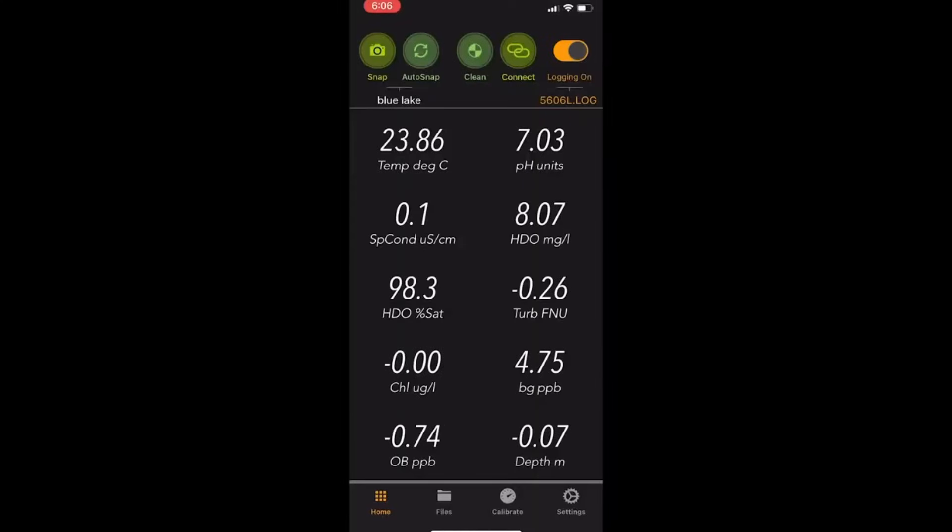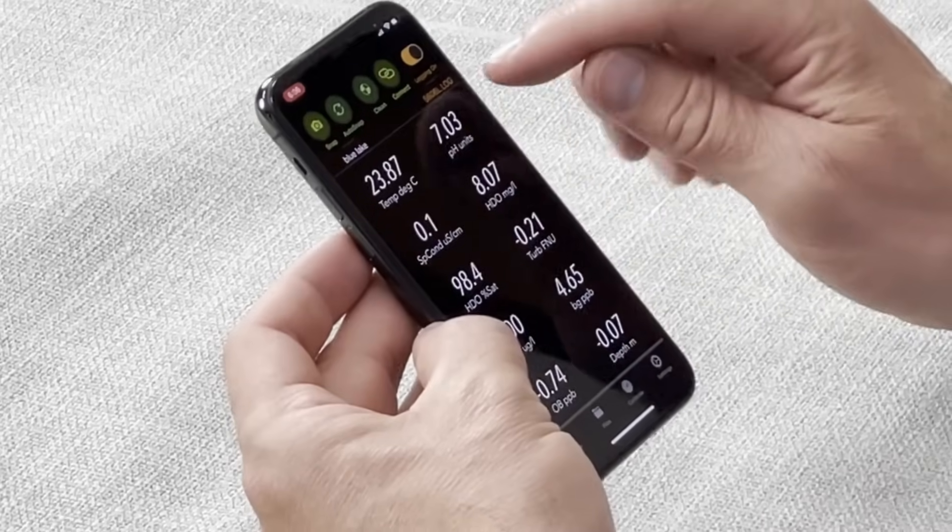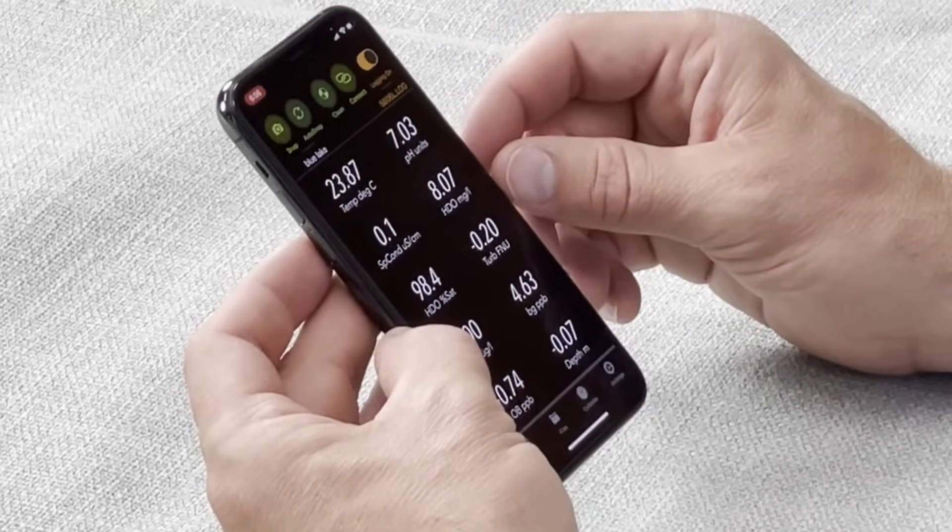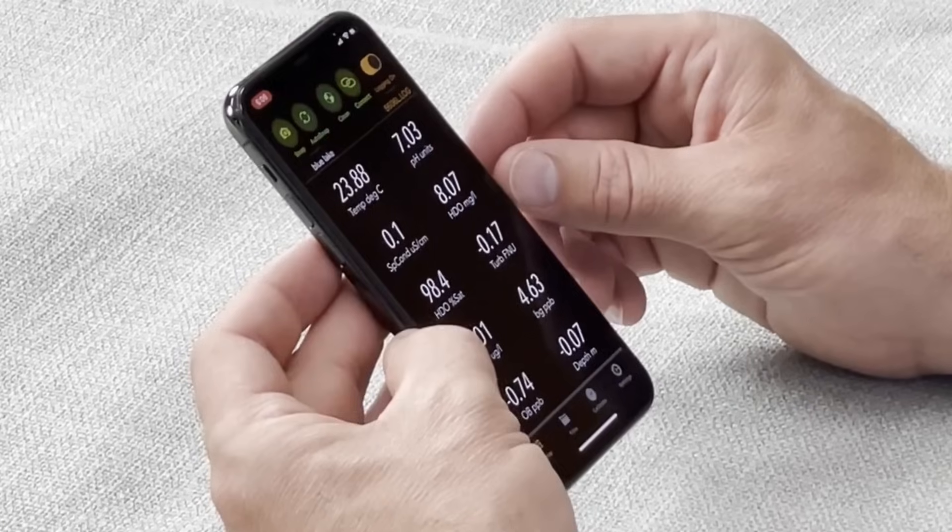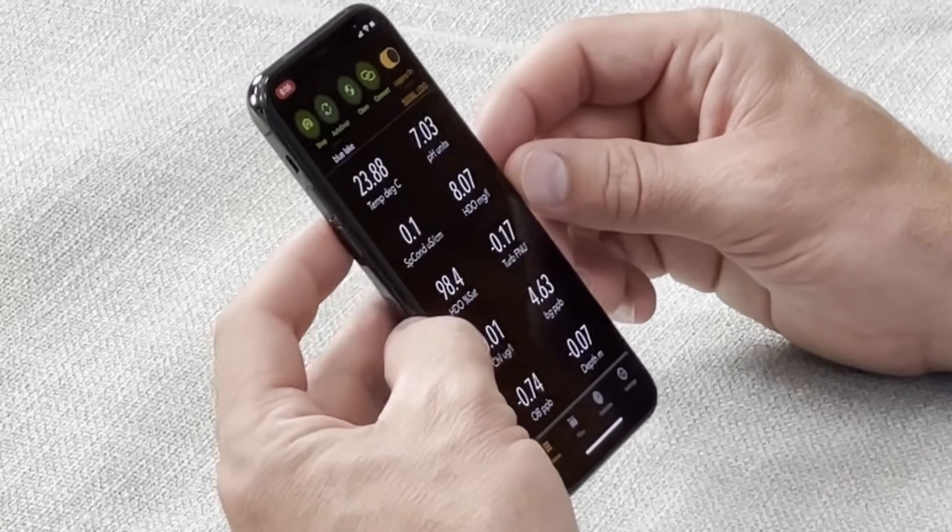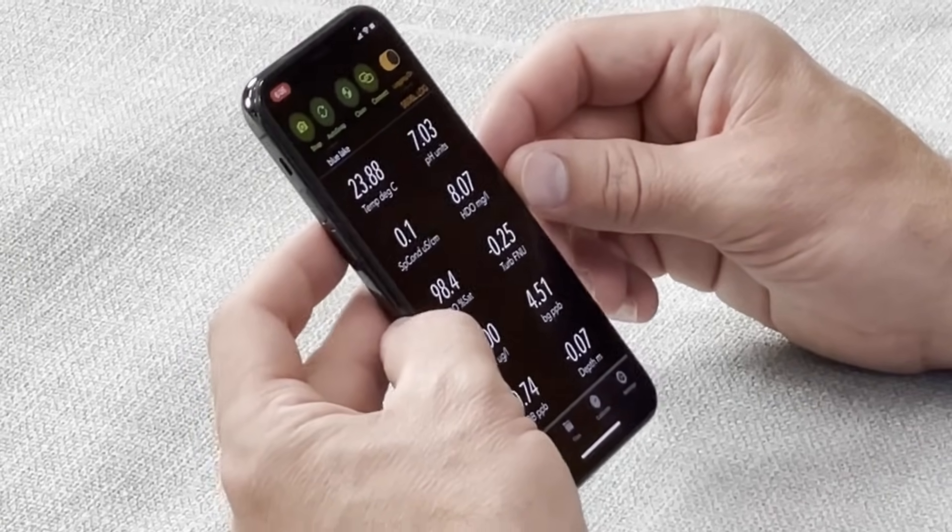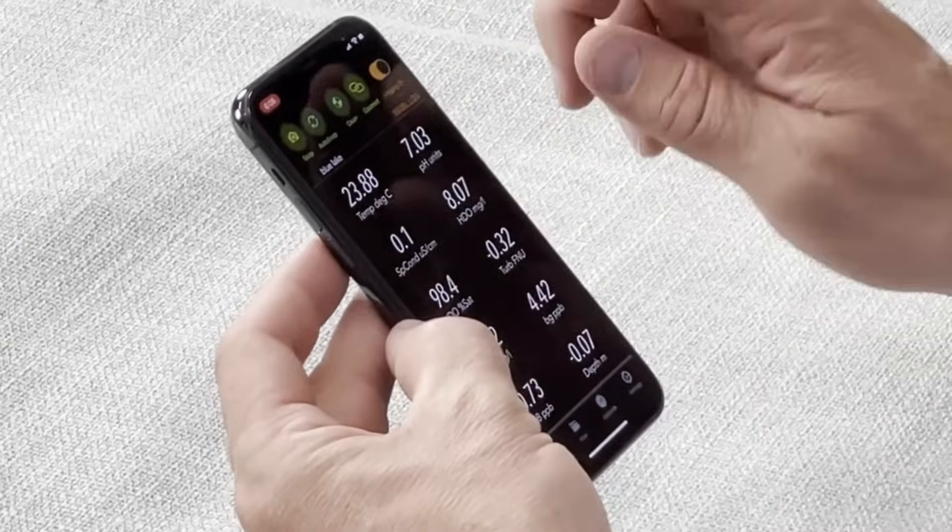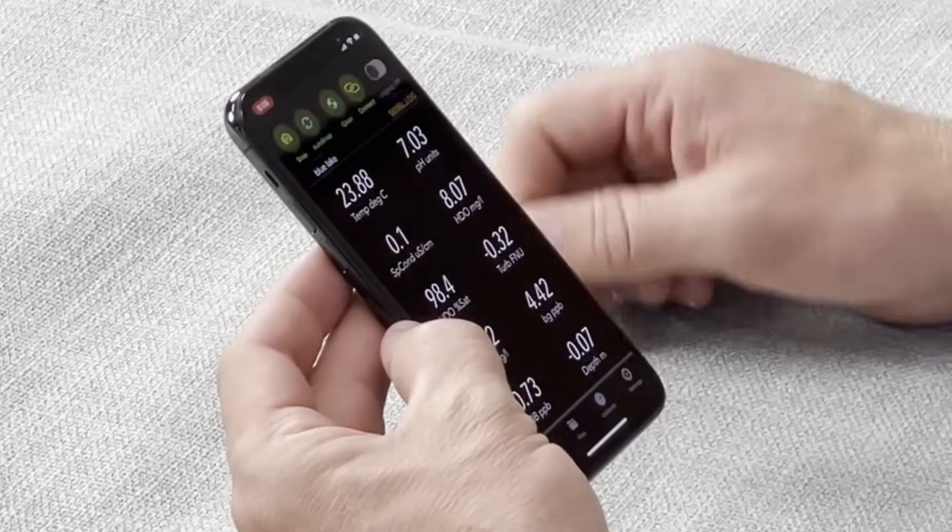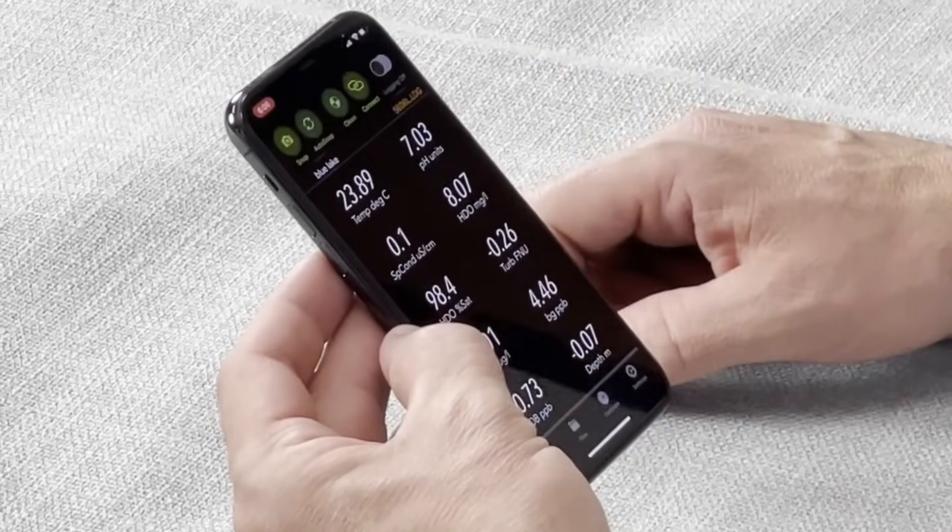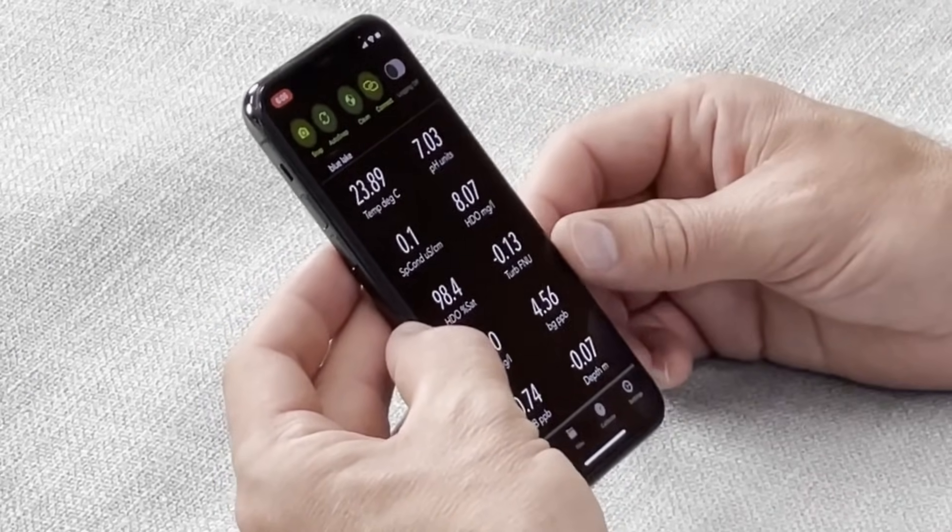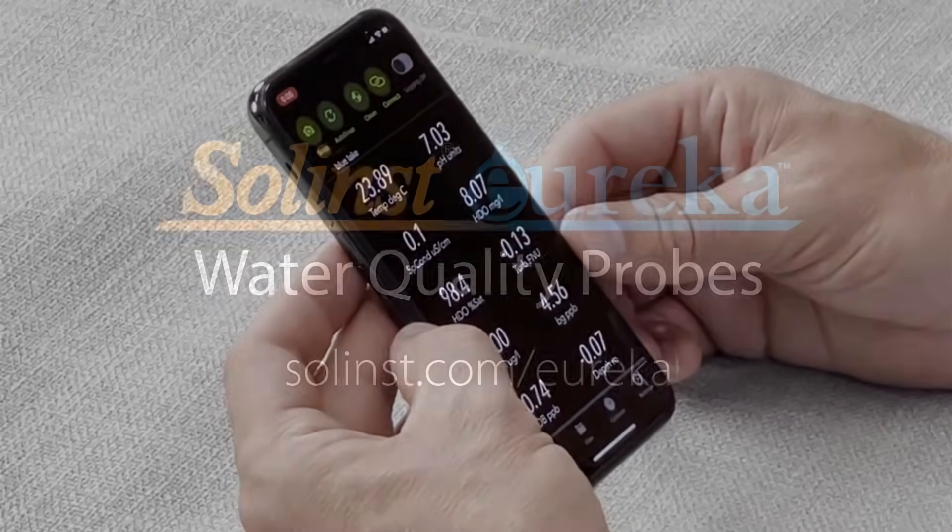You see that logging is on and it will be logging to that log file displayed right below logging on or off on a five minute interval. To turn logging off, simply tap it once again and you will see that logging is turned off.